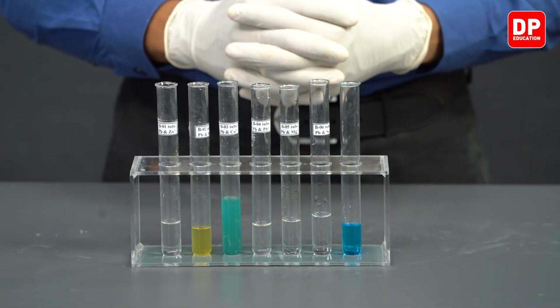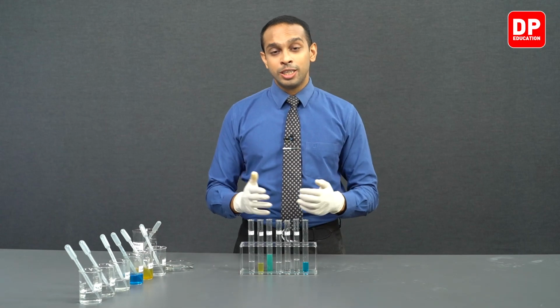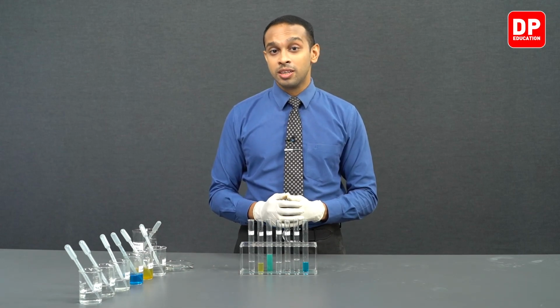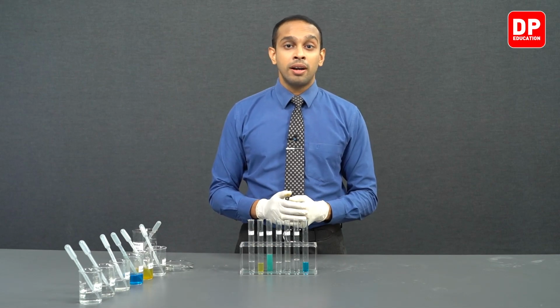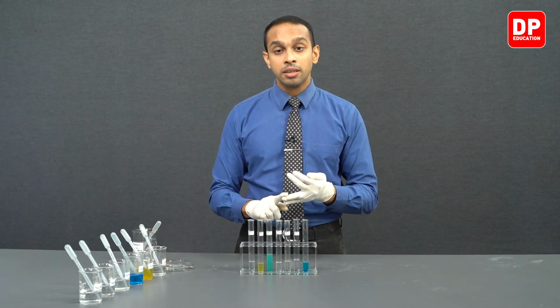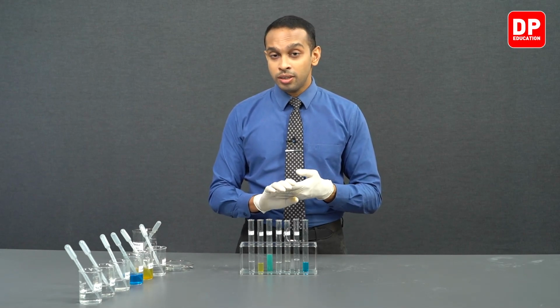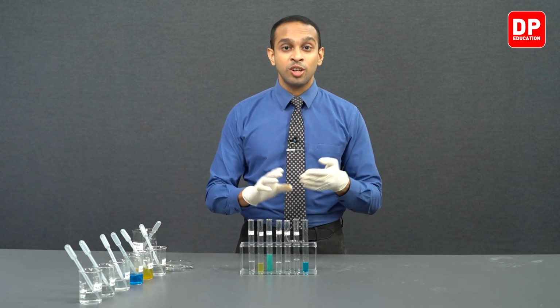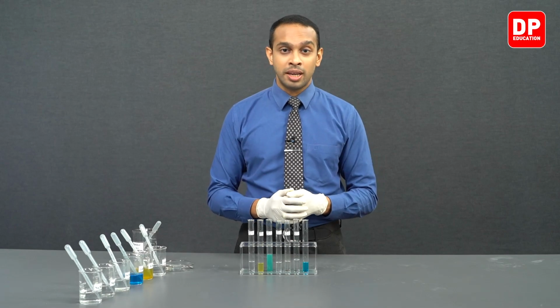So these are the observations you made in this part of our experiment, and based on these observations, we can conclude that lead was not as reactive as iron, zinc, magnesium, or sodium. Lead was only more reactive than copper. That is why lead was able to displace copper 2 plus ions as copper solid. So lead is more reactive than copper.